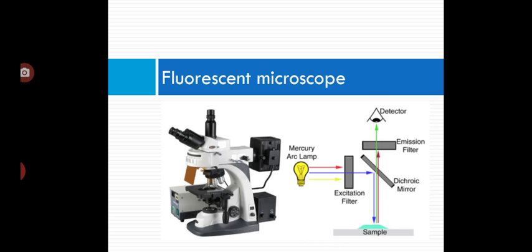This uses a high intensity light source which excites a fluorescent agent, which in turn emits a low energy light of a longer wavelength that produces the image. The fluorescent light can be separated from the surrounding radiation using filters designed for the specific wavelength, allowing the viewer to see only that which shows fluorescence.